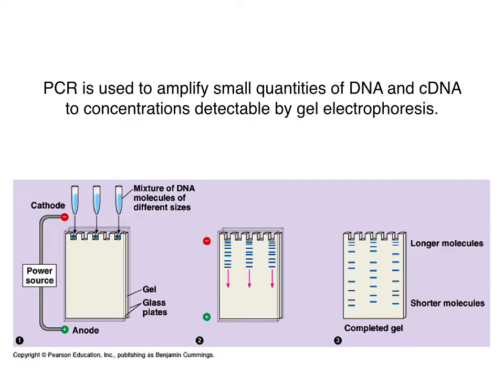In order to verify that a gene was copied and is the right size, an agarose gel can be run. A DNA ladder, which is a mixture of fragments with known size, can be loaded to compare with the PCR fragments. DNA, which is negatively charged due to the phosphate groups, will move from the negative pole, where the sample is loaded, to the positive pole due to the current being passed through the gel.